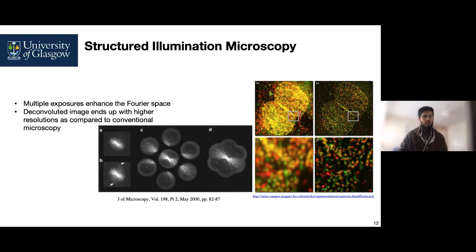If we zoom in on one subsection of the conventional microscopic image, we see a lot of blurred regions. Compared to this, we see that there is probably a twofold resolution enhancement for structured illumination microscopic techniques.